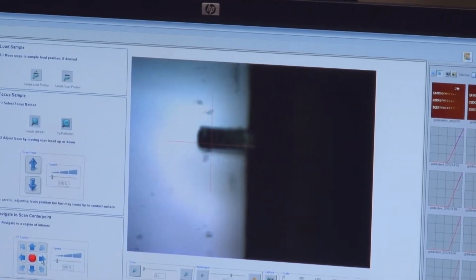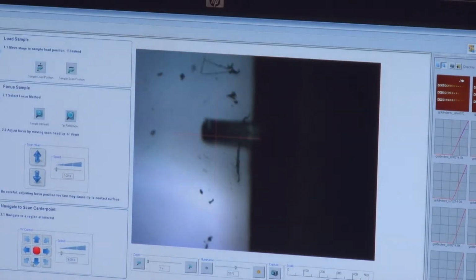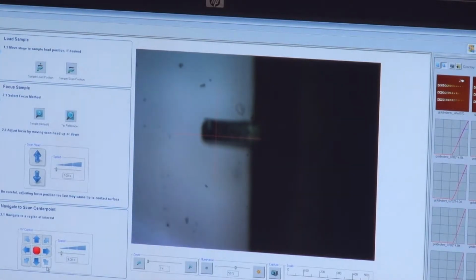Now it's important to both have a clean spot on the surface and to have something that is suitably hard, such as sapphire or silicon, because we want to be able to decouple the bending motion of the cantilever from the actual indentation when we perform the nanomechanical experiment.